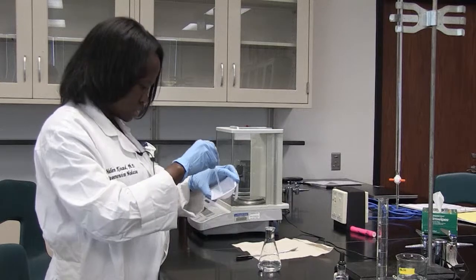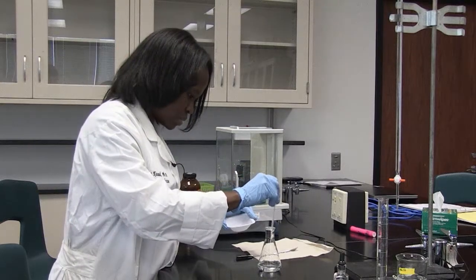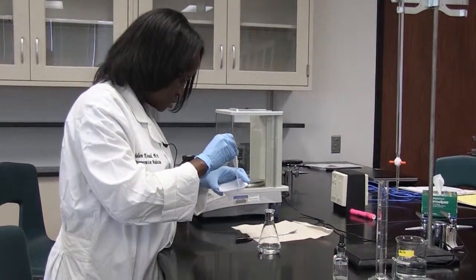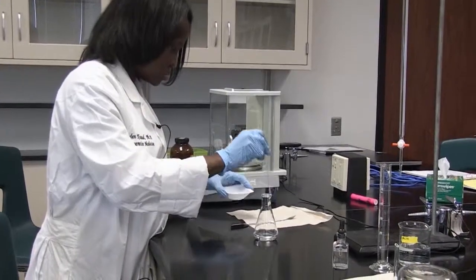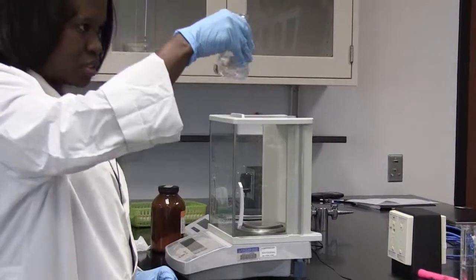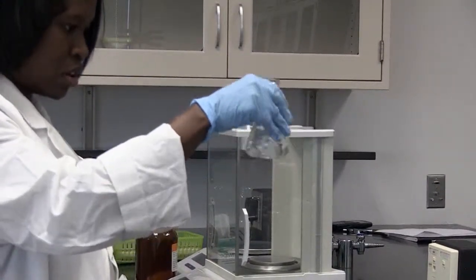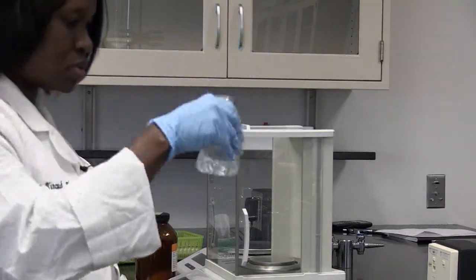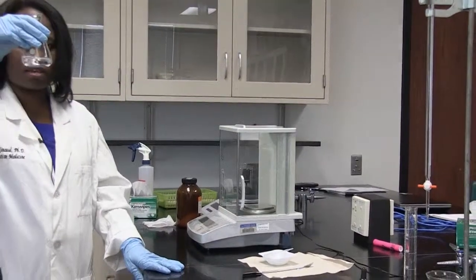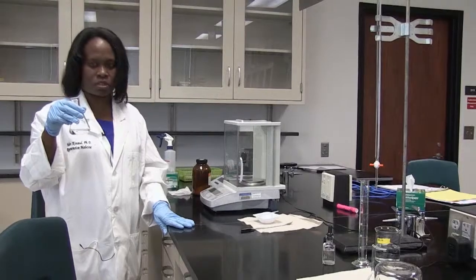When I'm done, I try to suck as much of the solution back into my Erlenmeyer flask. And I mix again because I still see some crystals. You try to mix until all your crystals have dissolved into the water. So now I've successfully dissolved my KHP into my water and I'm now ready to do my titration.